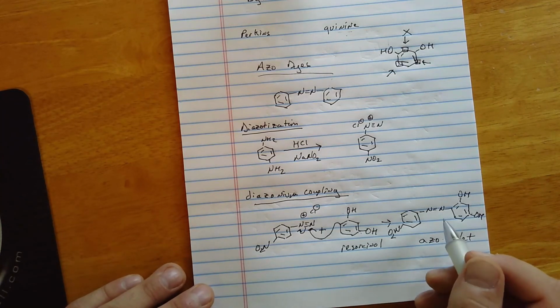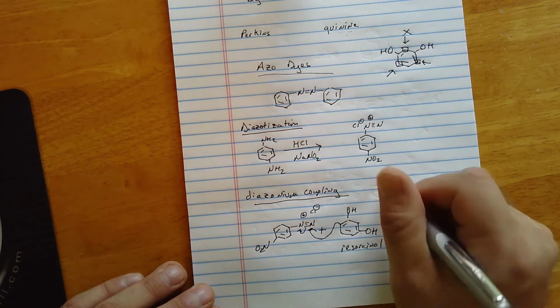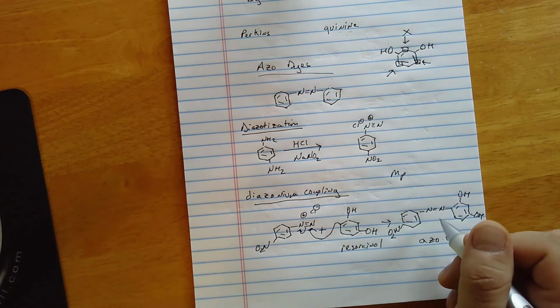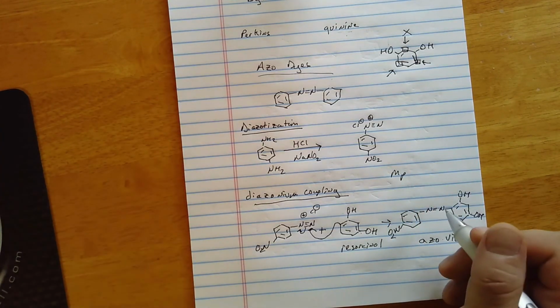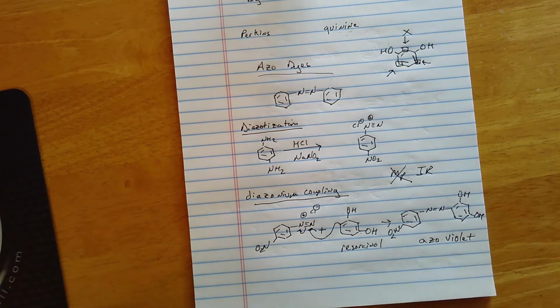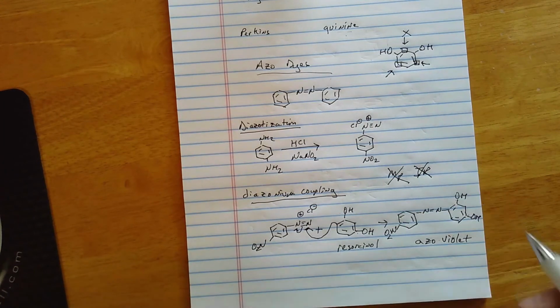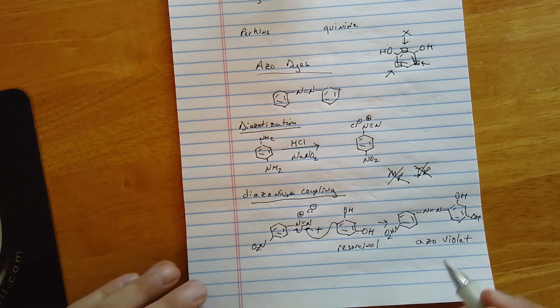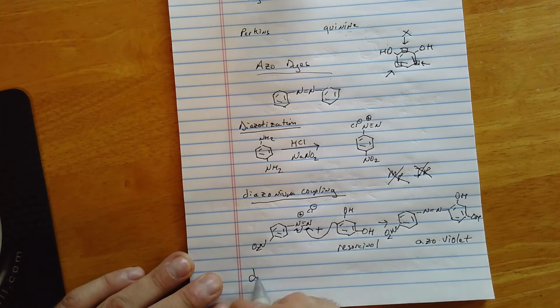There is one minor hiccup to this, and that is product analysis. We can't do our standard product analysis of melting point because the product decomposes before it melts. So melting point is out, and the IR is beyond messy, so we're not going to take an IR. So we're going to analyze our product a little bit differently.